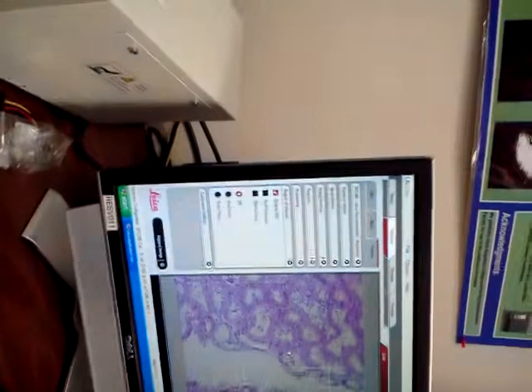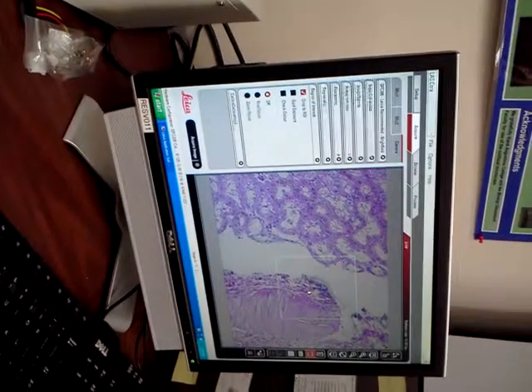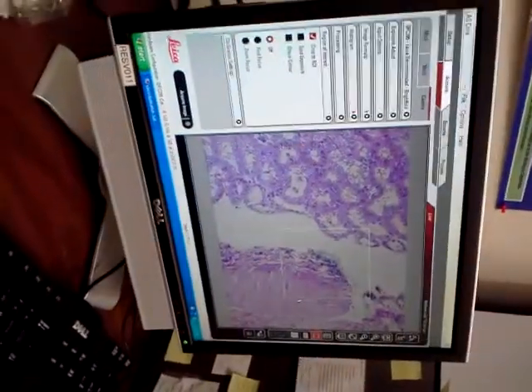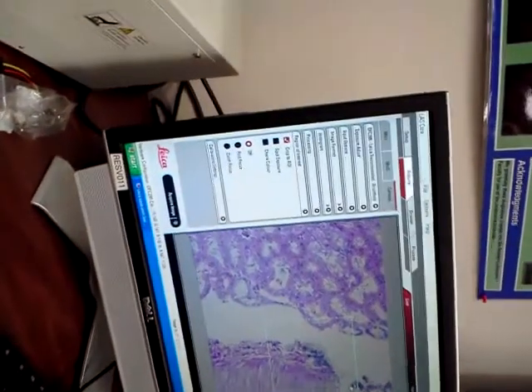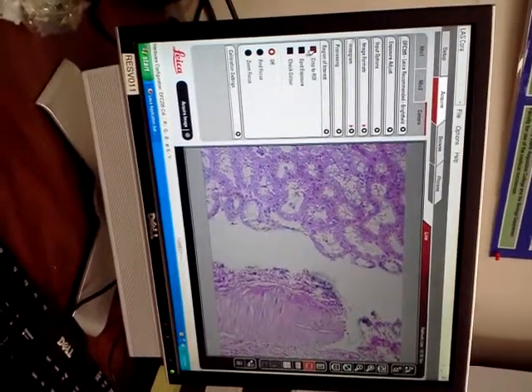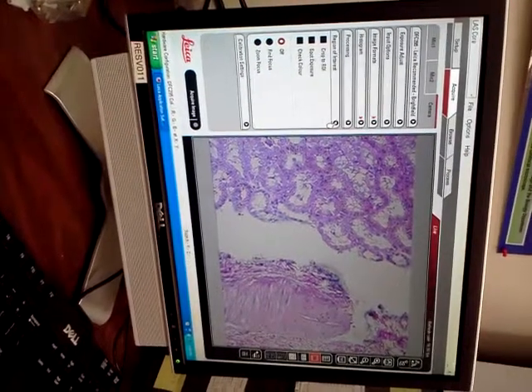Even here you're zooming in on that, but do you mean just save that box and not the rest of it? No, I mean save the whole image with the inset box that is zoomed on your area of interest. That box isn't zoomed though, not in that case, because all I did on that one was a region of interest, which was a crop.